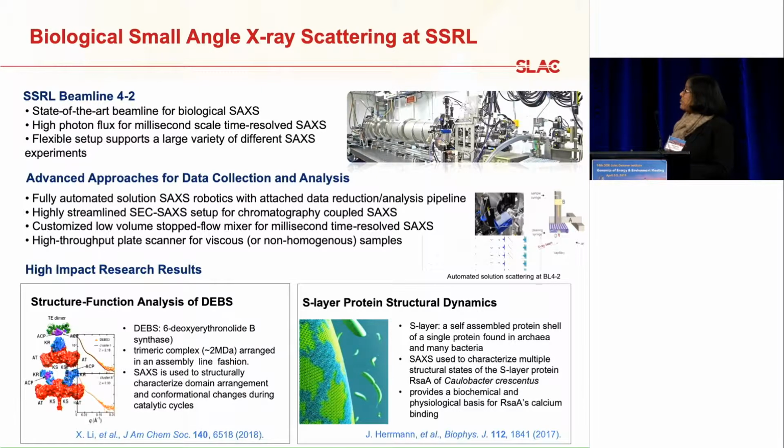So we have one beamline facility to do biological small angle X-ray scattering at SSRL. What we do is solution structure determination, both in static macromolecules and in macromolecules which are in action.